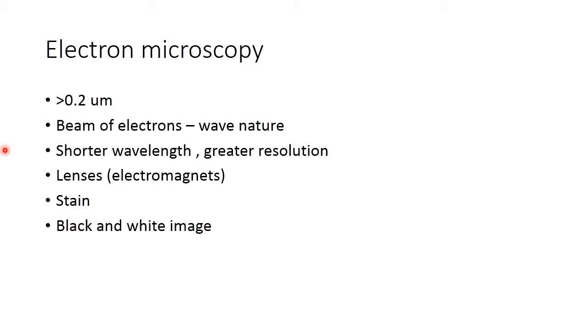For example, in case of bright field microscopy, we use several different types of stains which are colored dyes. They bind to different parts of the specimen or the background and hence they produce color. Therefore, the specimen is visible as compared to the background. For example, you would have used different types of staining agents to look at the cells.